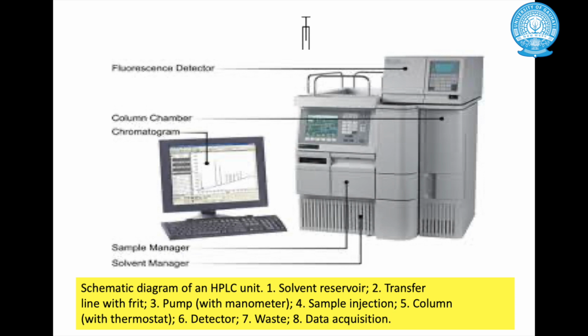to extract only non-polar compounds. The elution of compounds starts only after 25 minutes of runtime, and it goes on up to 60 minutes, which means that the compounds which are present in this hexane extract are interacting with the column material for a longer period of time, and because of that they are eluting slowly, and it is taking time.